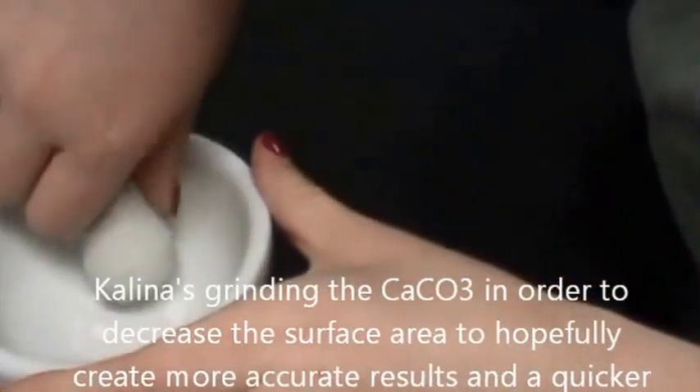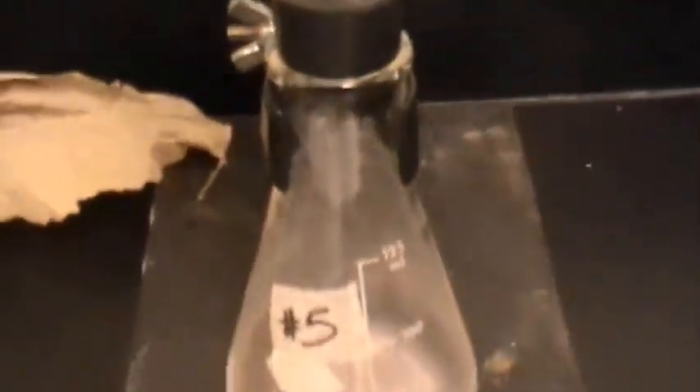We only have four minutes left on this. Here we have our second trial for the 4 molar hydrochloric acid, because the first one stayed at 45 milliliters for at least 10 minutes, so we've started a new one. This only had 0.52 grams of calcium carbonate, which was a slight difference.